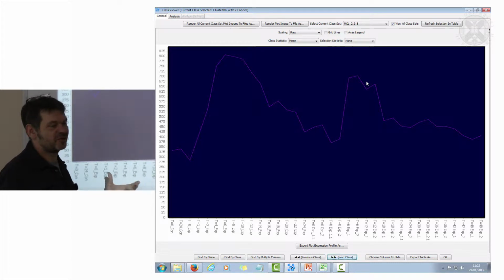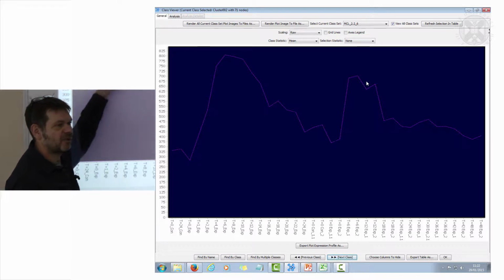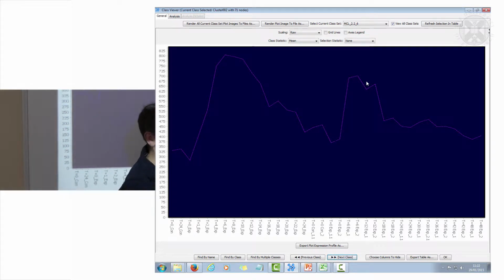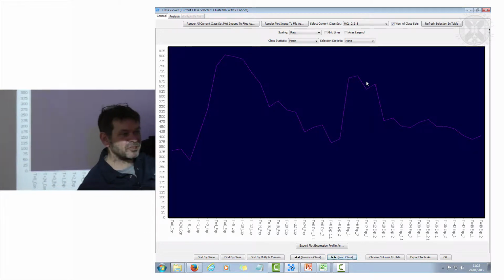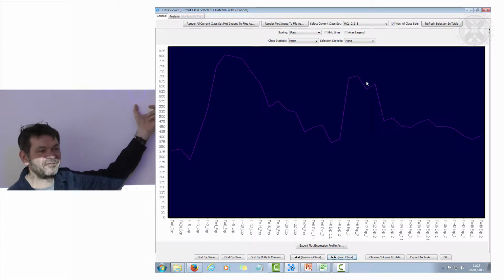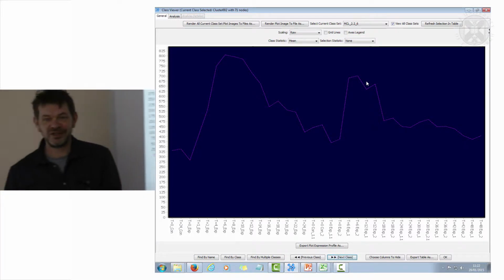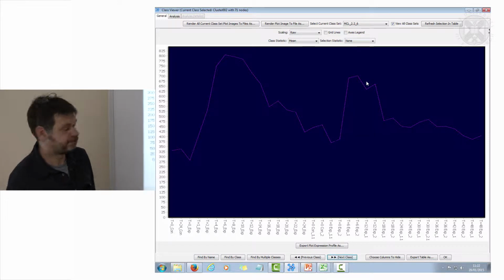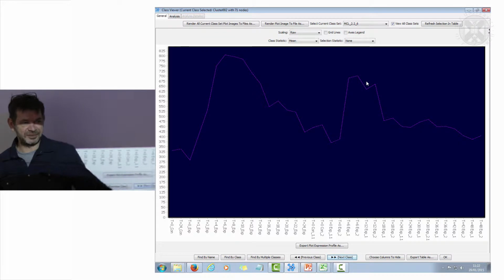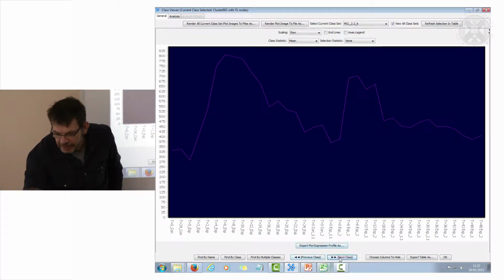So when you put in more time points, you get far more information about how it went up and when it peaked. When you look at only 6 hours, that could be the peak, or it could be on its way down by 6 hours. You don't know, because you've got a big gap of time course where you don't really know any information about those genes. So generally I like to do lots of time points over lots of replicates. And it turns out with this experiment, we learn nothing after 24 hours because everything kind of goes back to asynchronous.